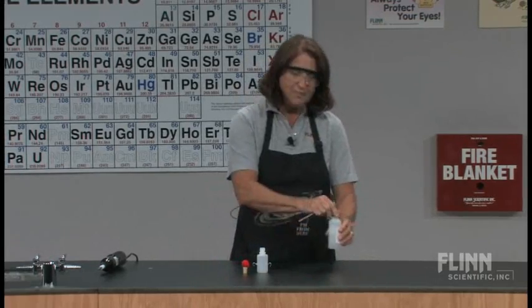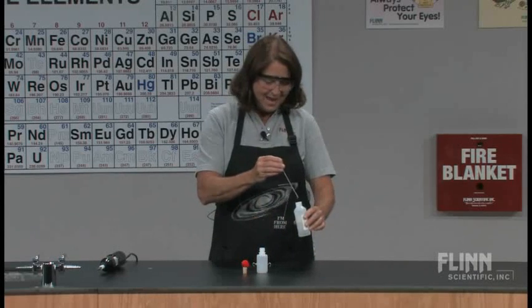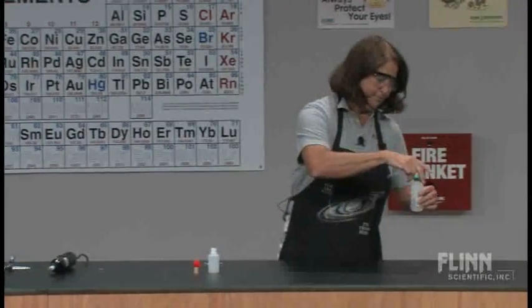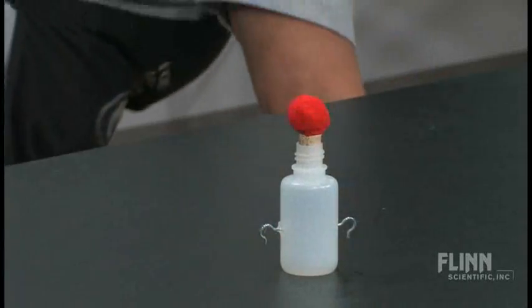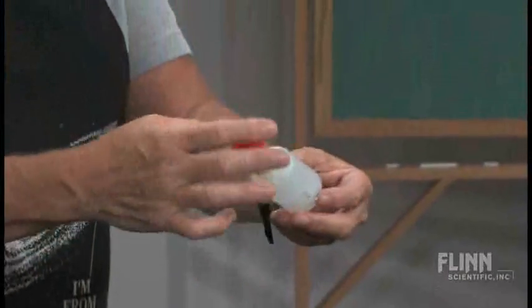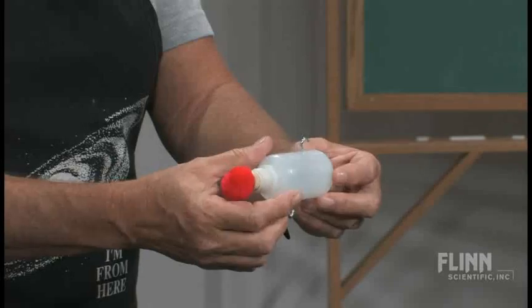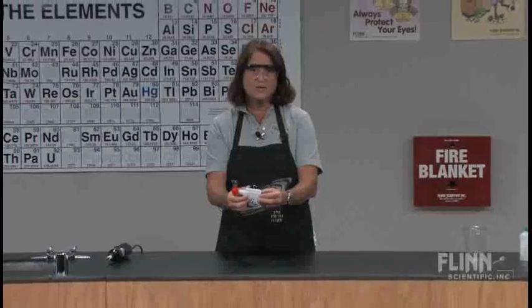Here's what we're going to do: I'm going to make an explosive mixture — that should appeal to a few of you. I'm going to take about a milliliter of ethanol, squirt it down into the bottle, and put the cork on the top. I'm going to roll this around, taking advantage of surface area, coating the sides of the bottle so that the ethanol evaporates faster. As it mixes with the air in the bottle, it's going to create an explosive mixture.